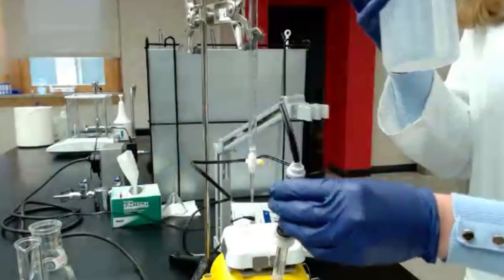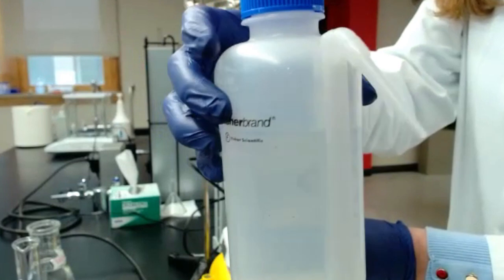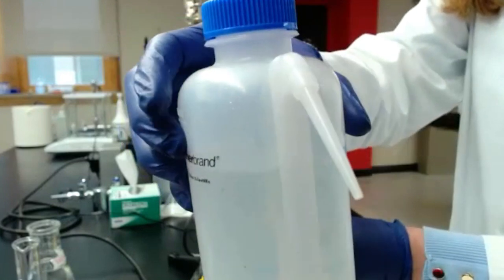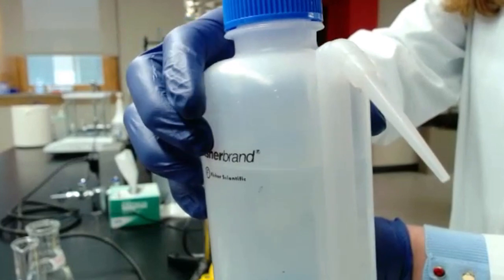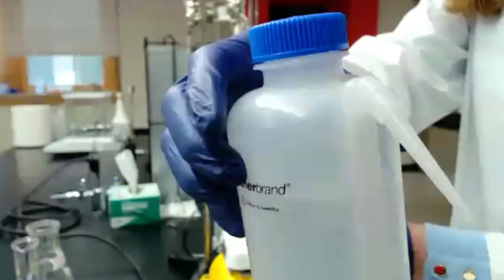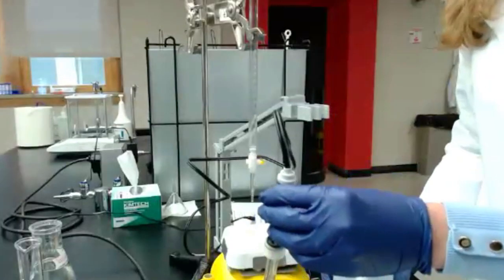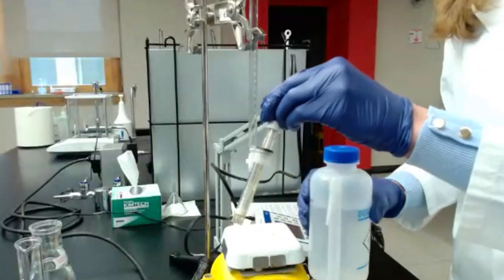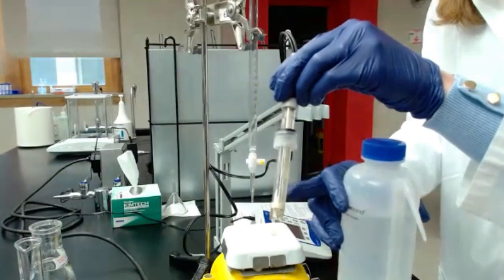You should also have a water bottle with deionized water. We have those fancy bottles, but if you don't have this one, that is totally fine. Just make sure you have a way to use some water to rinse, because that's what we are going to do first: rinsing the electrode with DI water.